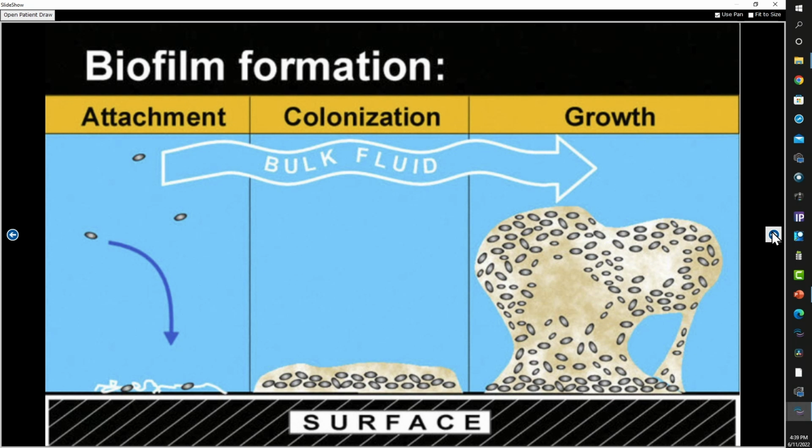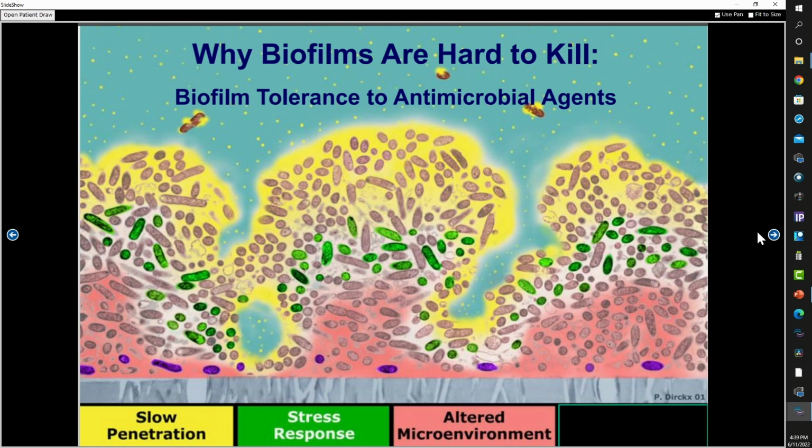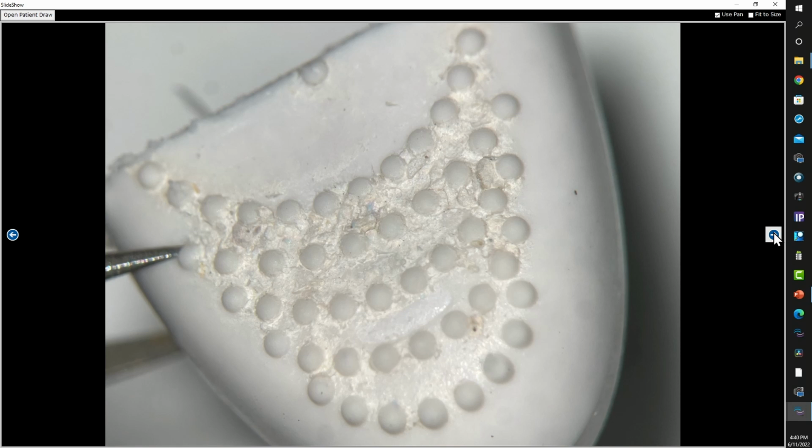that are inside. The problem is, in imaging these, many times they're missed because you can't see the original organisms. They are multiplying in layers within this goop, this EPS, and oftentimes they are completely obscured by the EPS, and you have no way really of knowing that there are organisms underneath. It is very commonly mistaken for other structures. So this is what one of the samples looked like.